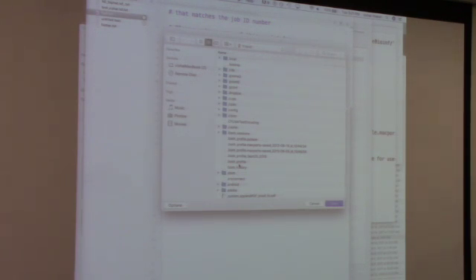We can also change the one on the server, right? Yeah, you can also change the one on the server. Absolutely. Because as soon as you connect to the server, that's the one here. So you have .bash history, you have .bash sessions. Oh, you don't have bash profile. So you can create one. You can actually create a hidden file. You just save it there. So if you don't see any .bash profile, Vishal, could you check? You have one or you don't have one? I do, but I don't. Then open it. Just double click and open it.